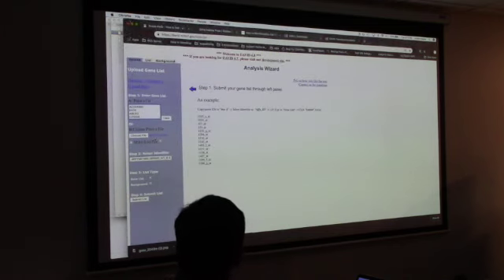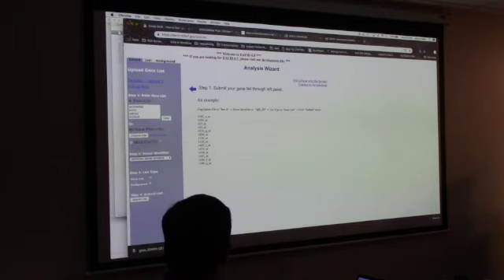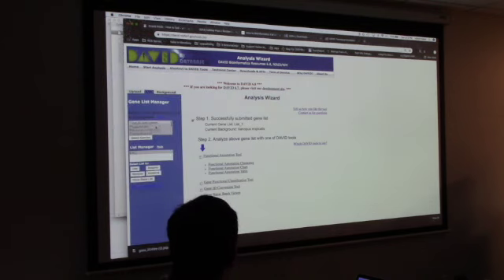Okay, and then these are all right here. You select your gene symbol, official gene symbol. Once you select that gene list, you can say submit list, and then it'll give you that pop-up saying, hey, you have to specify what species you are. So we're actually Homo sapiens.